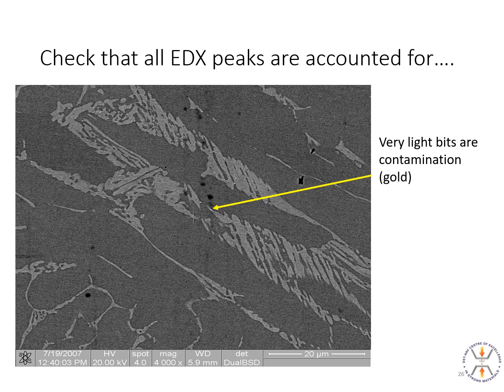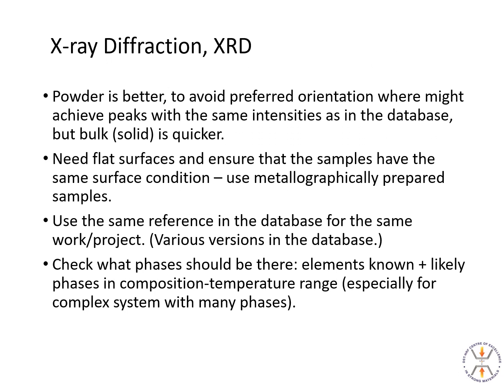Sometimes you have to spend ages finding bits that are nice enough to analyze. By nice enough, I mean big enough. Now, when you do your EDX analyses, you do need to look at the peaks, but when you report them, unless you want to show something on the peaks, it's best to report numerically. What we've got in here, you can see a lighter region, there's some more in there, and that was contamination with gold, because they had been making gold samples just before they made these samples. So those are some pitfalls for SEM, EDX.